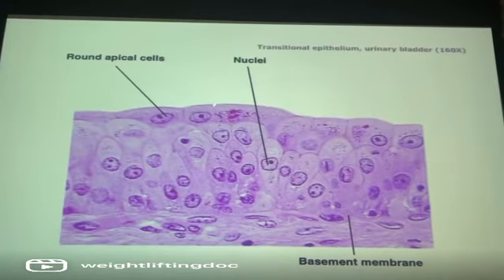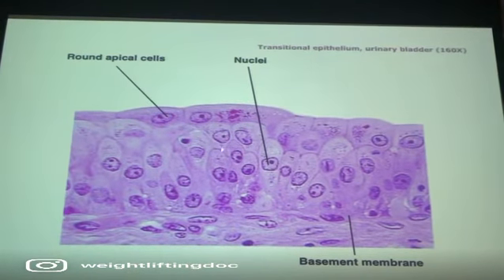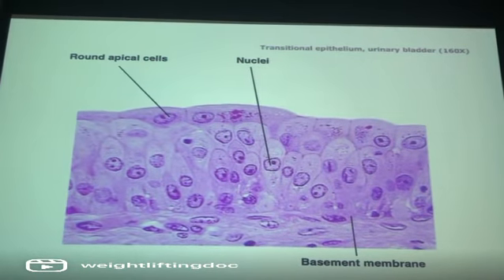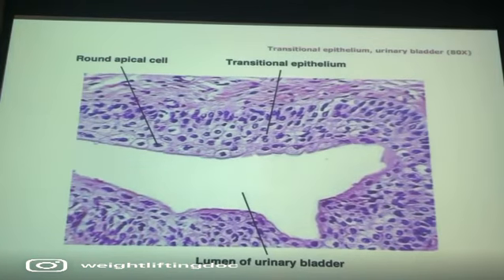Okay, these are transitional cells. You see how they're dome-shaped? They're rounded off. Look for the rounded off shapes. That'll help you identify transitional epithelium, which is the extensible tissue, right? It stretches, and so that's going to help us with that. It kind of falls in its own class, so it's not stratified or squamous.